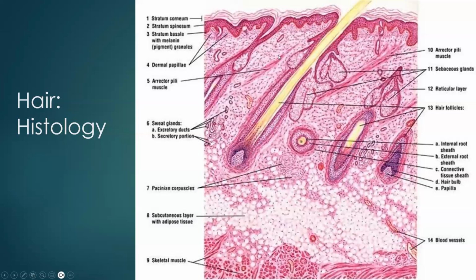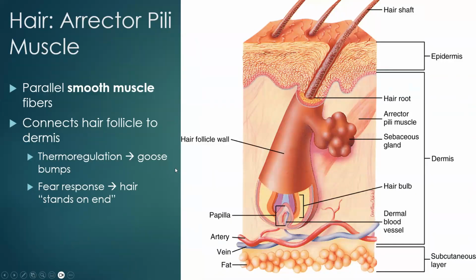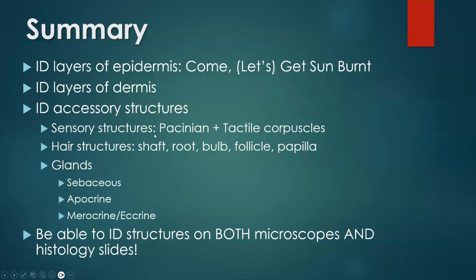I could ask you about the dermis versus the hypodermis. So down here, we're getting into that layer of adipose tissue, which is why you see all these white puffy cells here. And then, of course, we have our layers of the epidermis. So a lot of stuff going on from a microscope perspective. Okay, let's take a look briefly at that virtual microscope, and then I'll show you the key for our skin model.